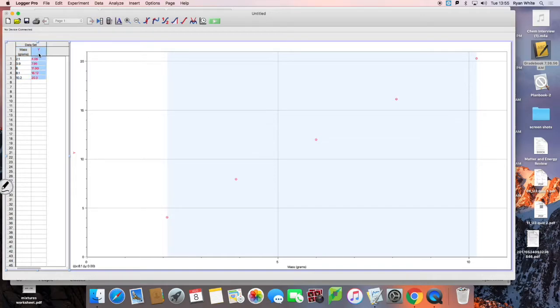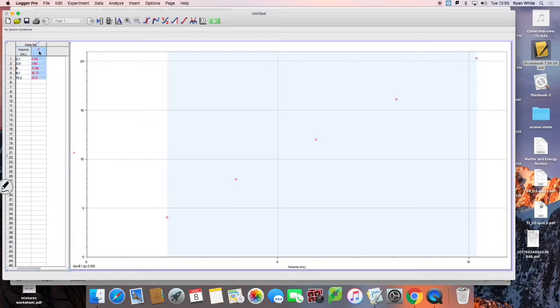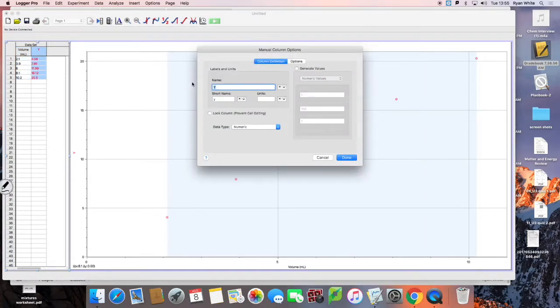Same thing here with y. I'm going to make this volume — volume in milliliters or centimeters cubed, your choice. On the y I'm going to put mass. I'm going to click on the label and then put mass, and then grams.